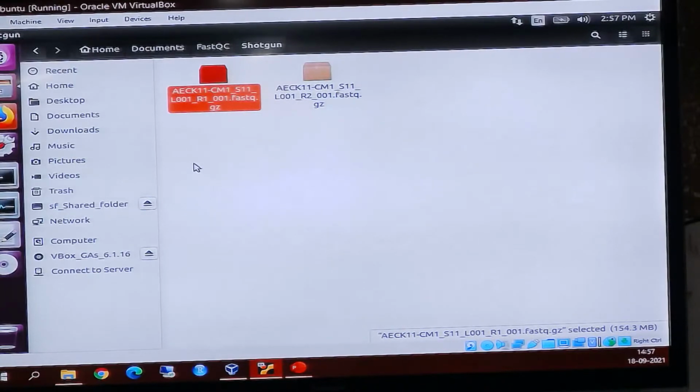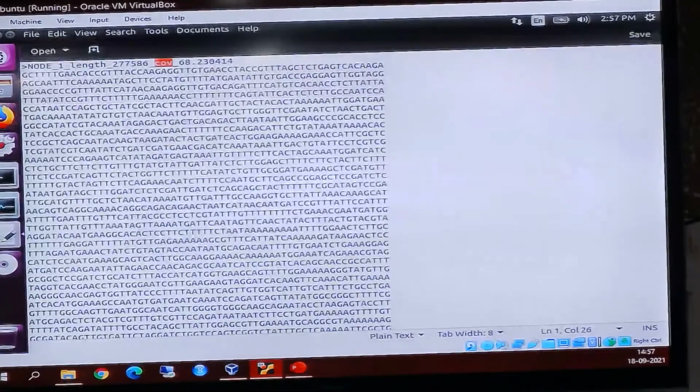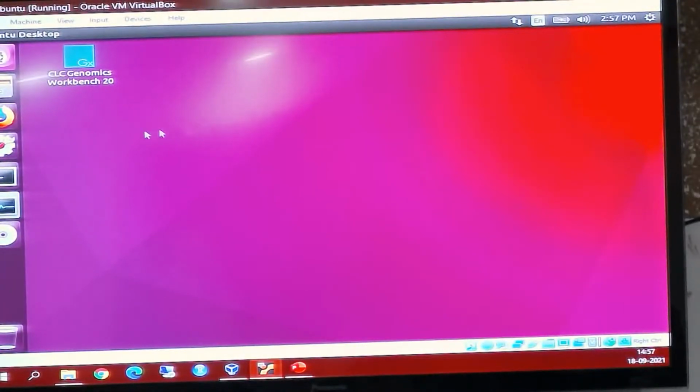We still have some time for our tea break, so you can discuss your doubts or even practice what we have learned so far. Yes, right, try now to run with different k-mers. Same data, different k-mers. You can try with the same dataset using different k-mers. That's what I want.